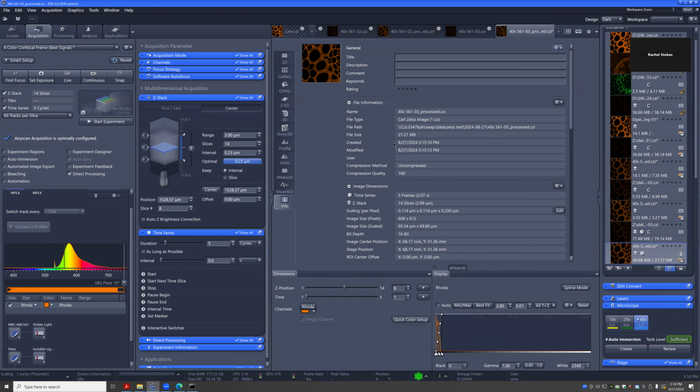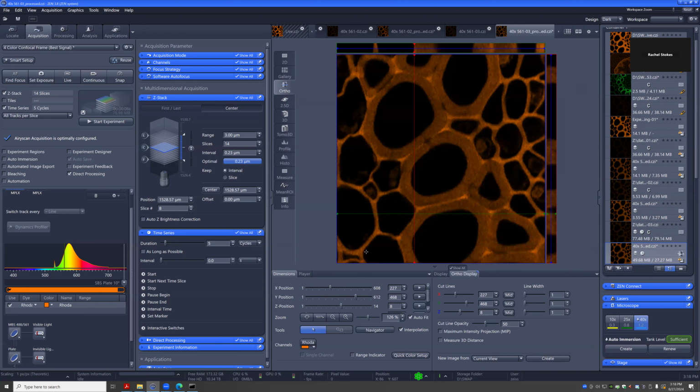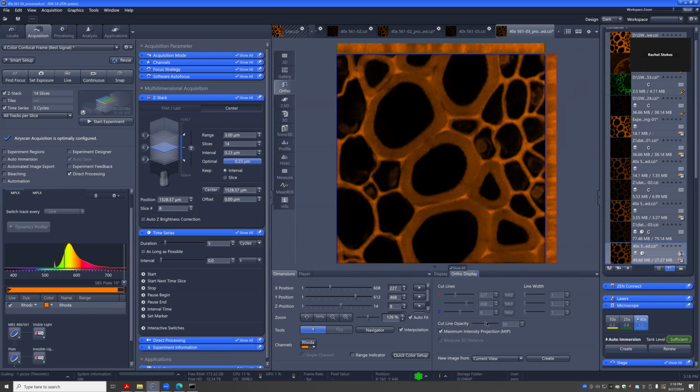But yeah, Z stacks, it'll store all the individual slices. If you want to do a maximum projection, right? Collapse all your slices in one go. I always recommend going to that ortho tab. Where is it? Maximum intensity projection here. You actually see a preview here. Then you can say, okay, I want either XY, XZ, YZ. Current view will just make all of these.